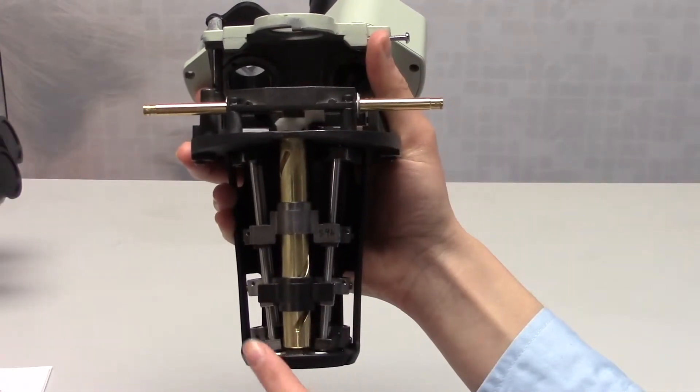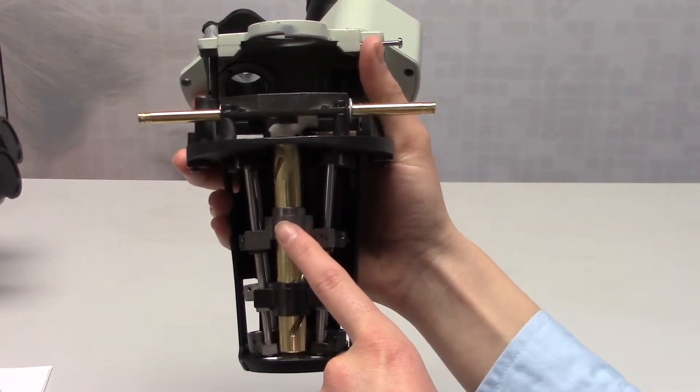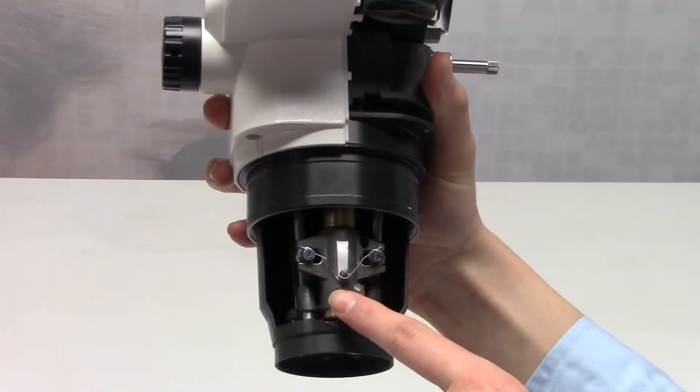Next, it is important we discuss how the objective lens moves through the microscope body. The single screw design used by Avon ensures the objective lens stays aligned for the life of the microscope. The tight manufacturing tolerances employed by Avon provide a secure and aligned fit around the lead screw without the use of adjustment springs sometimes needed on lower quality single screw design scopes.